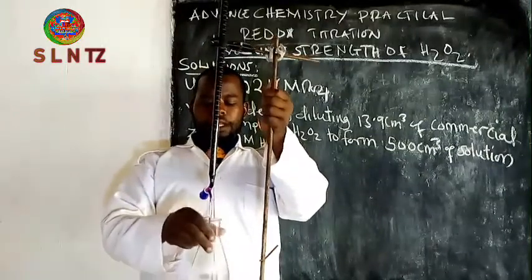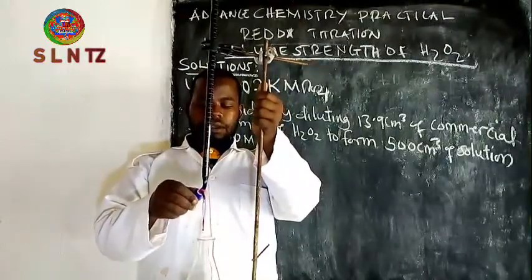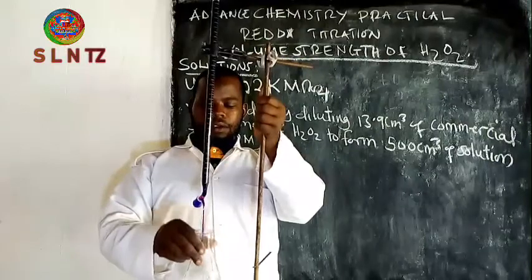But if you have a bench, you have to use both hands. It means one drop, one by one you shake. One drop, you shake.